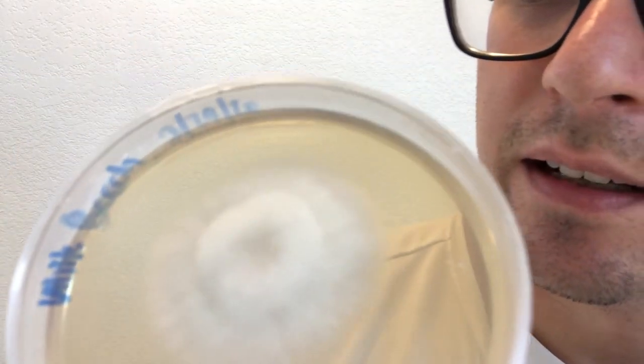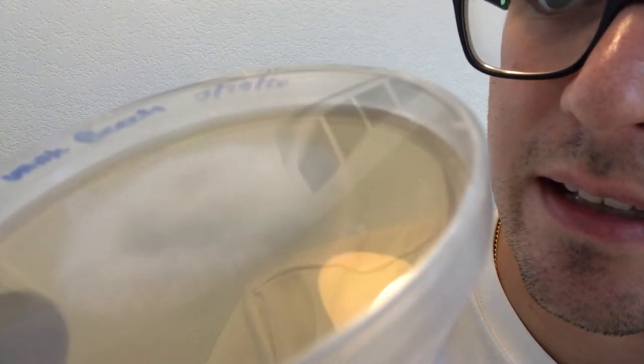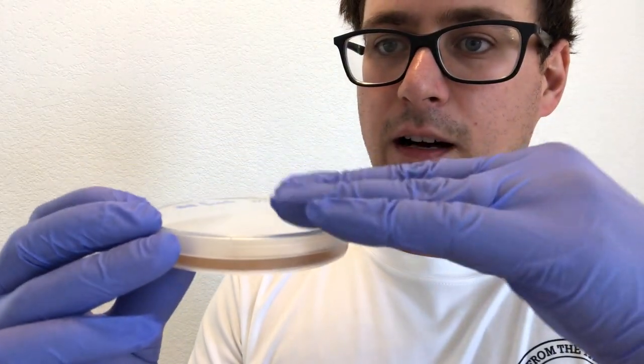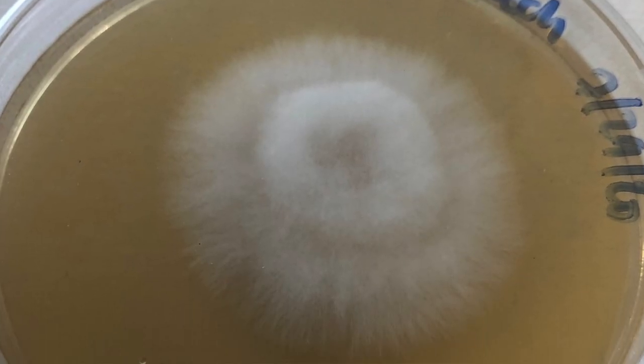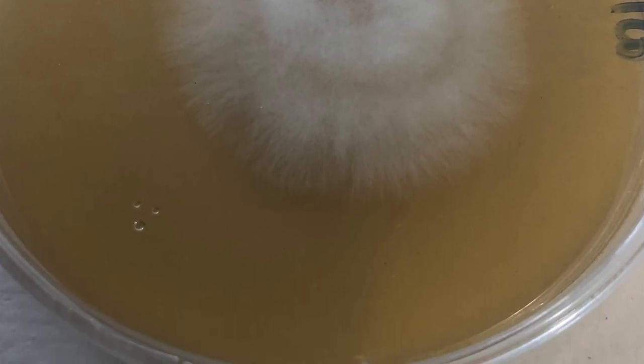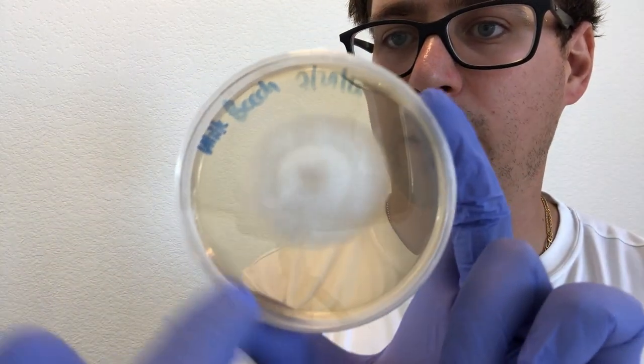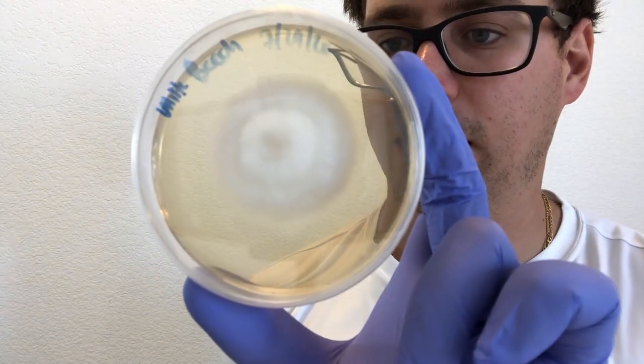Now we've got a beech mushroom here. Look at how raised this mycelium is. Beech mushrooms are really raised, and you can see that on this plate here—nice white and healthy. As I'm going through my petri dishes, I'm paying attention to the perimeter of the mycelium, making sure that there's no contaminants showing.